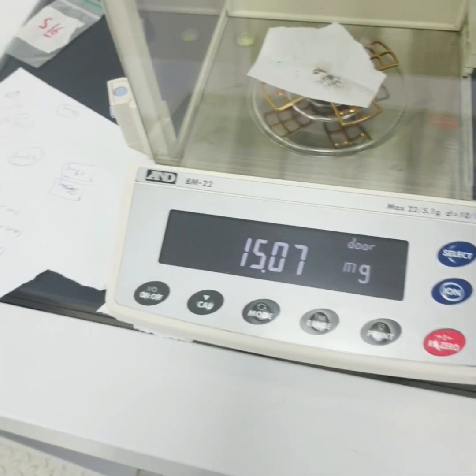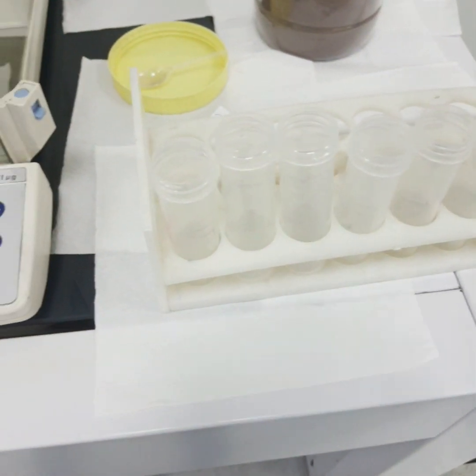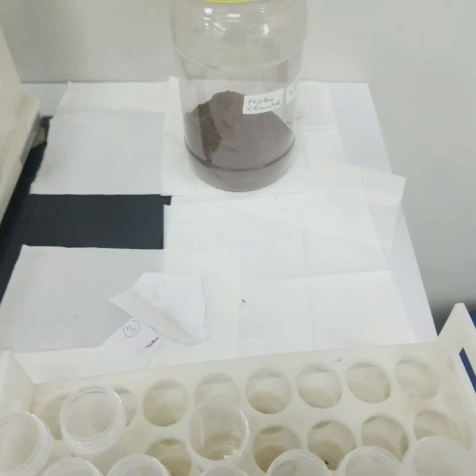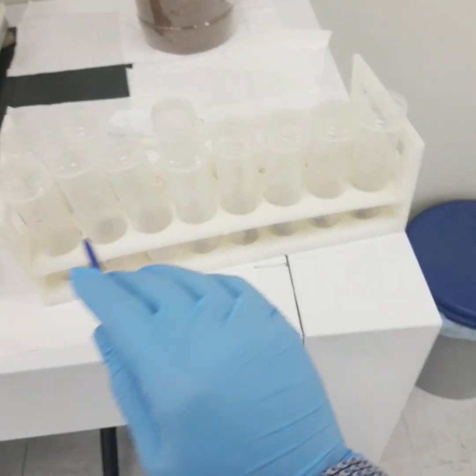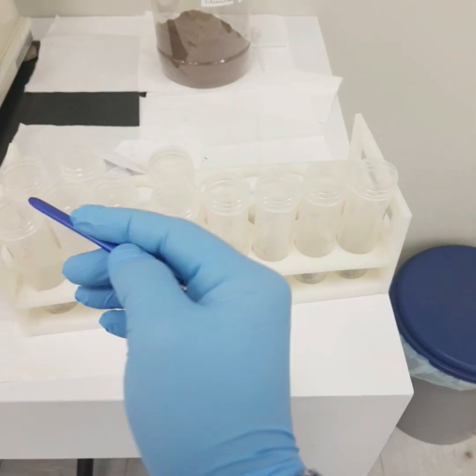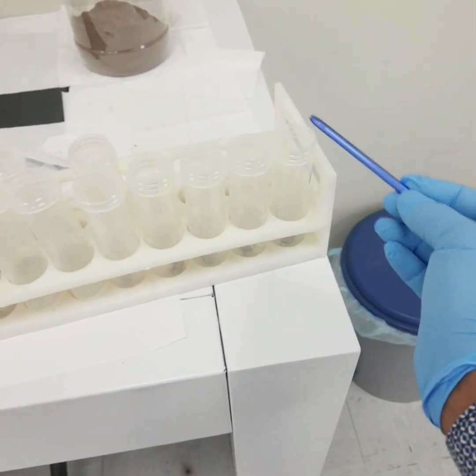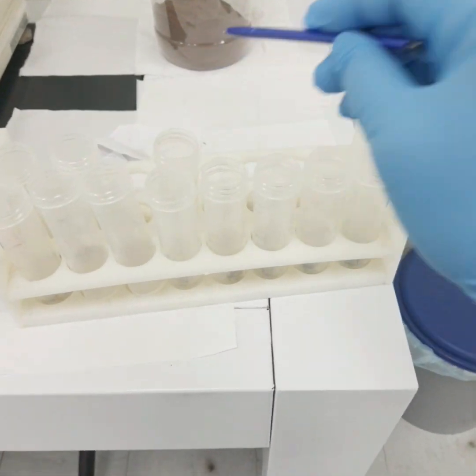dosage. We are going to transfer an equivalent amount of the adsorbent in all the vials here. This is around 15 milligram, and the adsorbent here is the raw pozzolana, raw volcanic ash. So we have made 10 vials, and this one will be for the control.